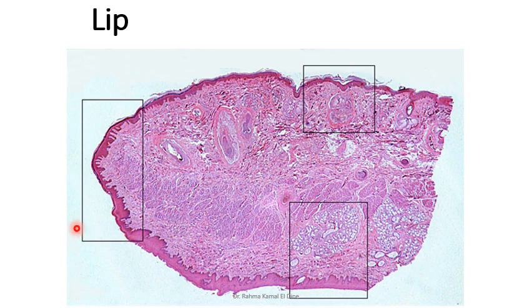Here is the red margin, or the lip margin, in which you can see no hair follicle and deep dermal papillae. You have no hair follicle, sebaceous, or sweat gland.